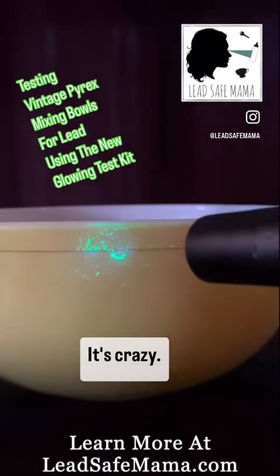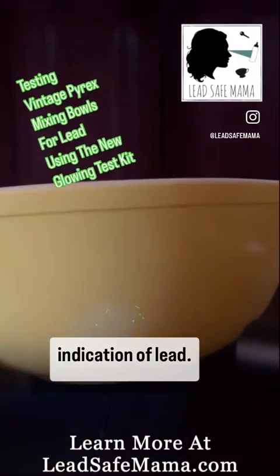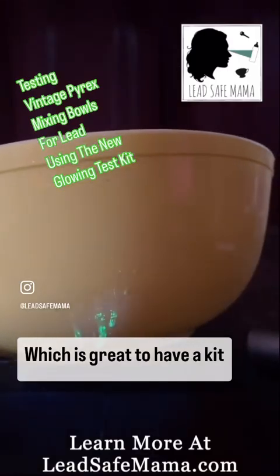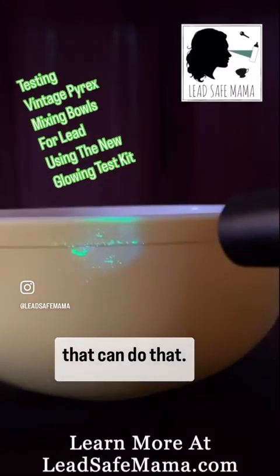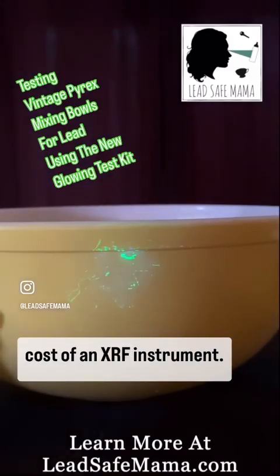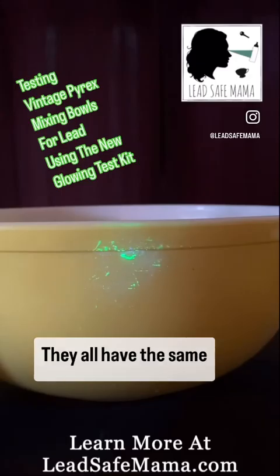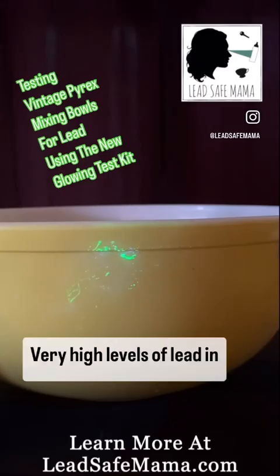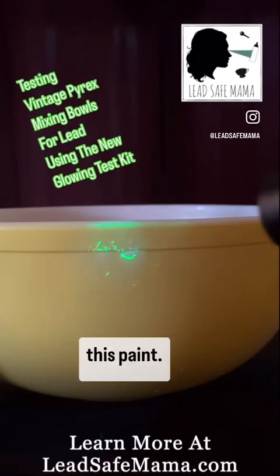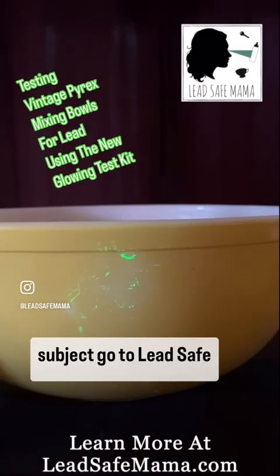And it just gets more intense as the minutes pass. That is a very strong indication of lead, which is great to have a kit that can do that — at a tiny fraction of the cost of an XRF instrument. Tamara's tested thousands of these bowls. They all have the same results: very high levels of lead in this paint. You do not want these bowls in your house. To learn more about this subject, go to LeadSafeMama.com.